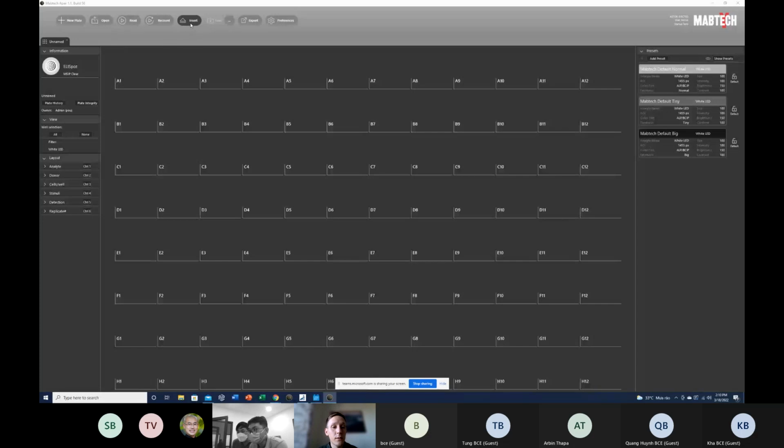So should we insert the plate into the machine first? You can click on that button just to see. So click on insert, but it's completely fine to click on read right away, because the machine understands that it should both insert and read.